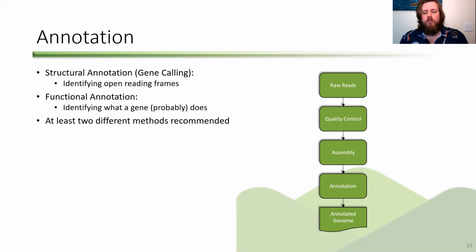We send our phage off for standard bacterial sequencing. So when we get back several million reads, which are enough to give 10,000x plus coverage on our phage genome, we can map that to our de novo contig, and then do a variant analysis and look for really rare variants in that population. I generally don't find more than a handful of one or two SNPs, which is expected. But what I'm really looking for are insertions or rearrangements, something that would give me pause. But at the very least, you want to do the things I've laid out here. So you don't actually have to do a variant analysis. It's just something I like to do, and I would recommend looking into it if you have the time and the expertise to do it.